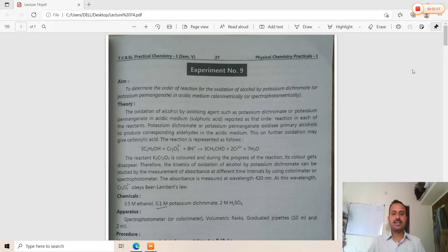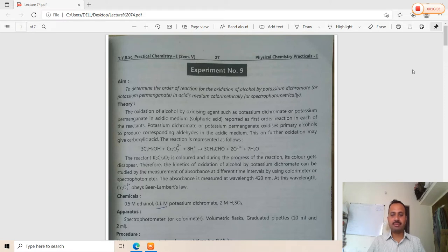The apparatus required includes a spectrophotometer, volumetric flasks, graduated pipettes of 10 ml and 2 ml.